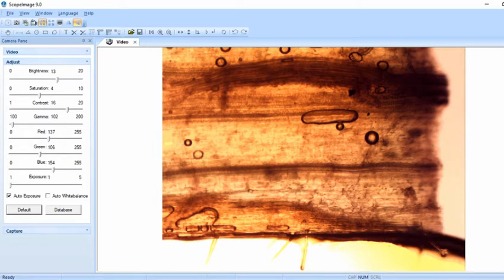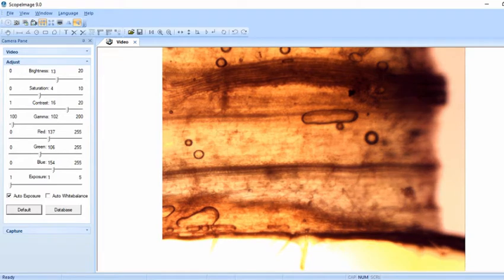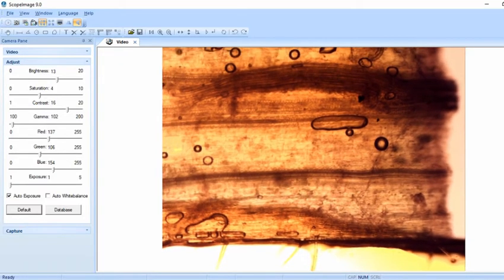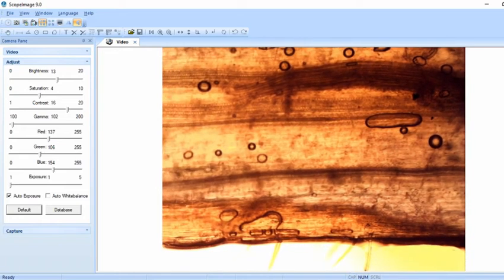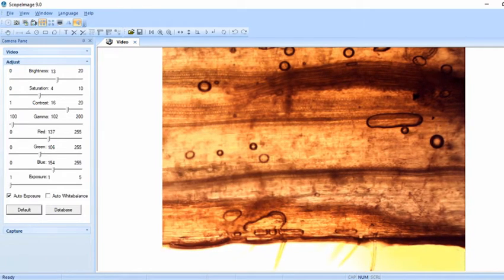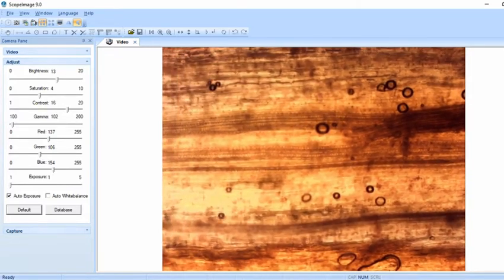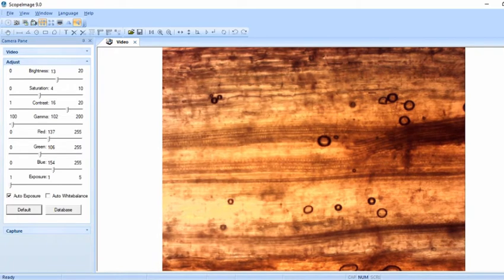Anyways, I've been doing some work on observing capillary action in geranium tissue for reasons. And I noticed in all these samples that I've collected of geranium leaves and stems, I've been cutting them very thin with my scalpel. I've noticed that along the vascular tissue, it looks really cool. Here, I'll kind of zoom in a bit.